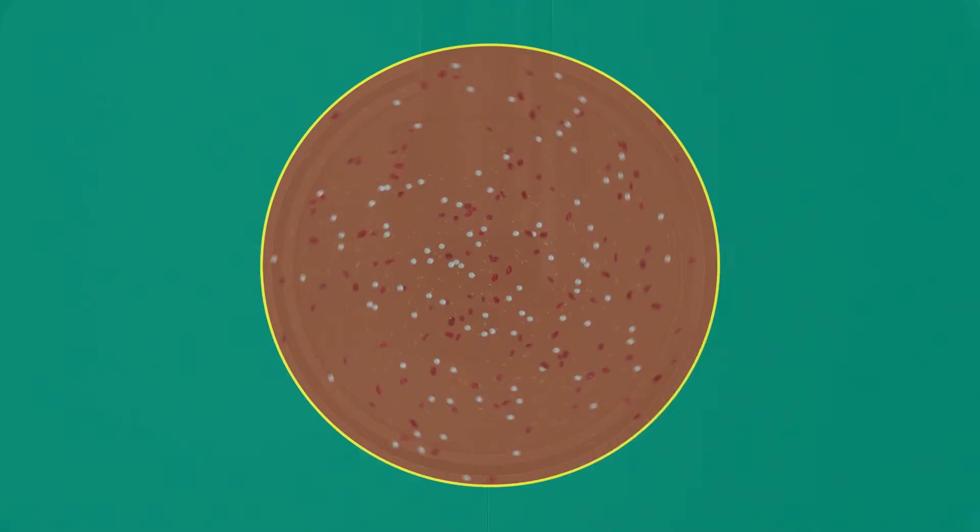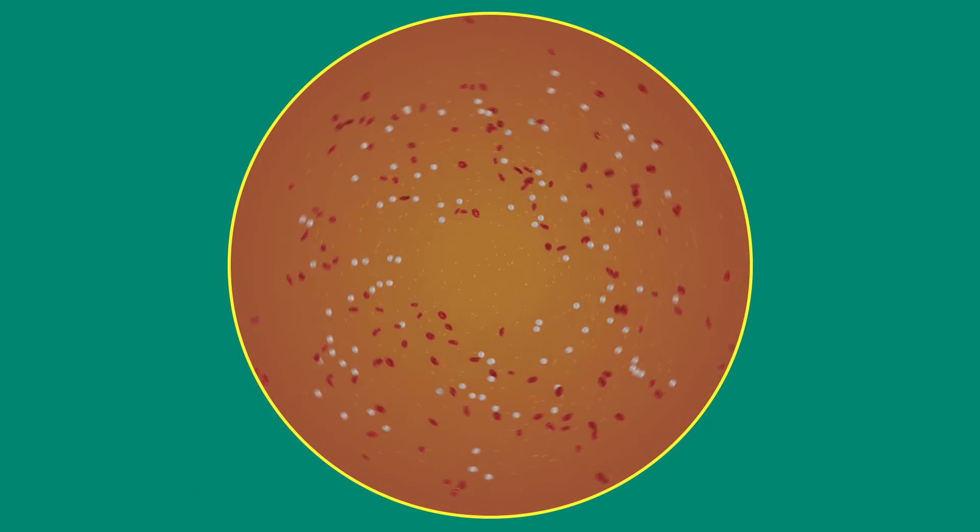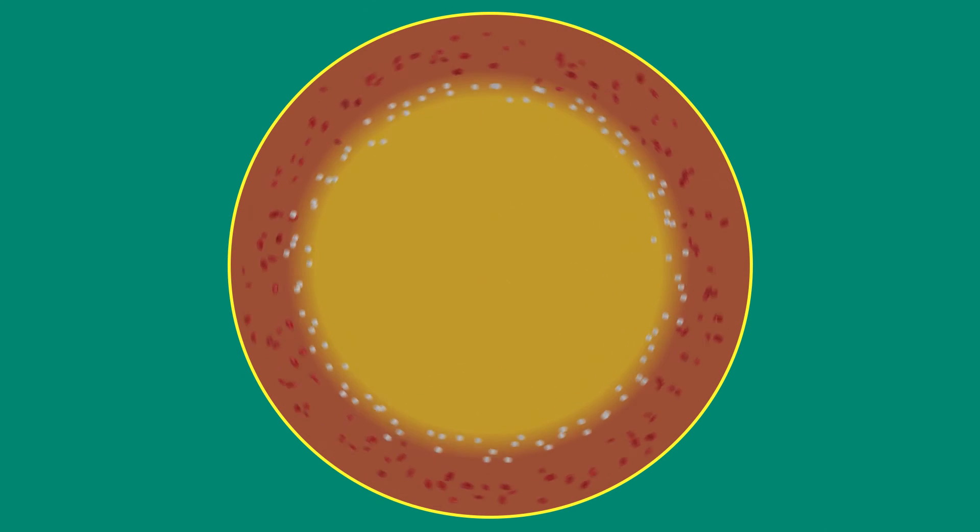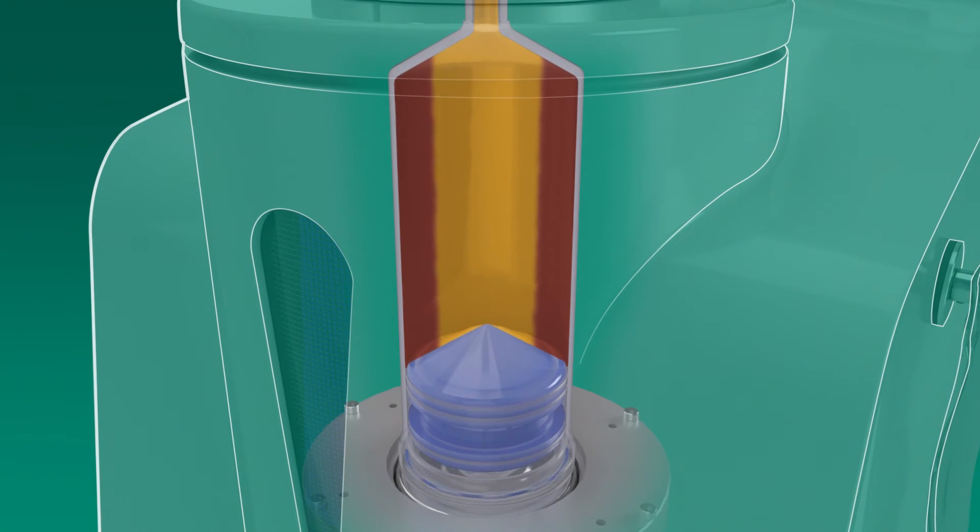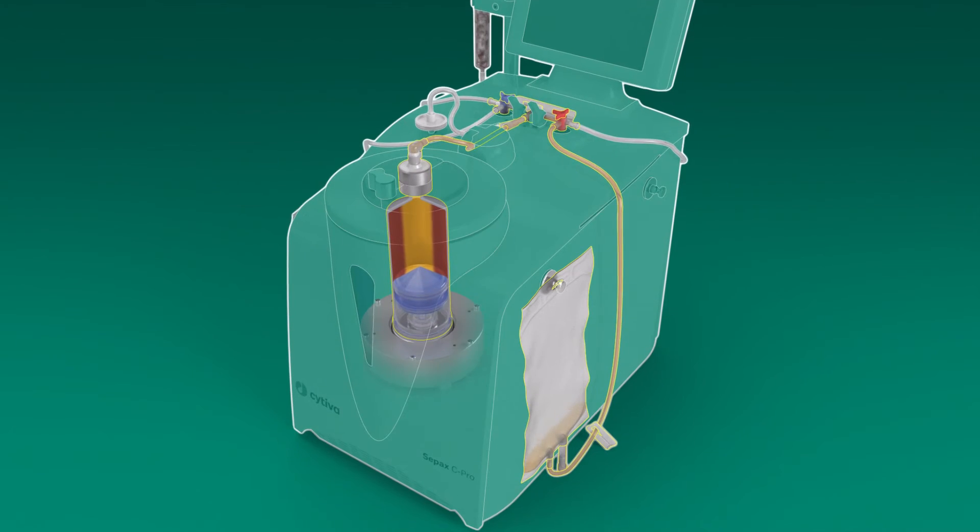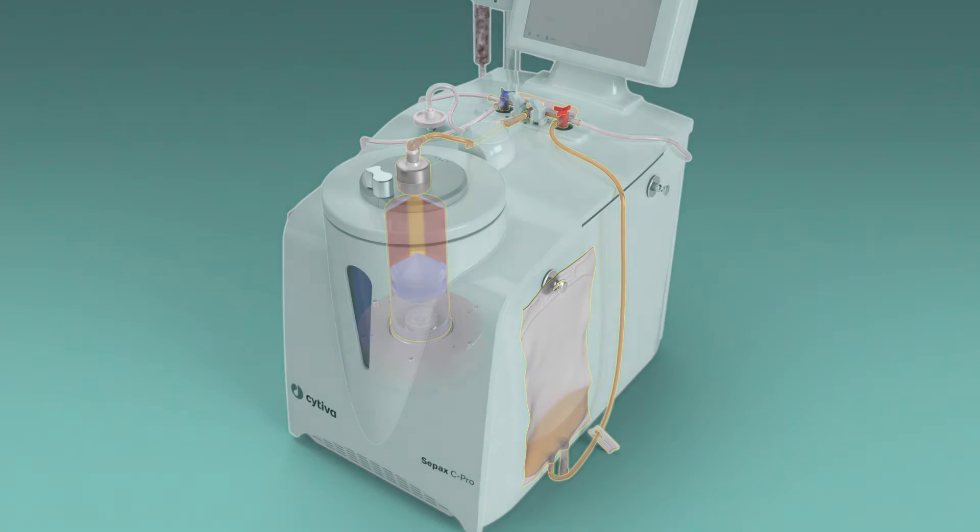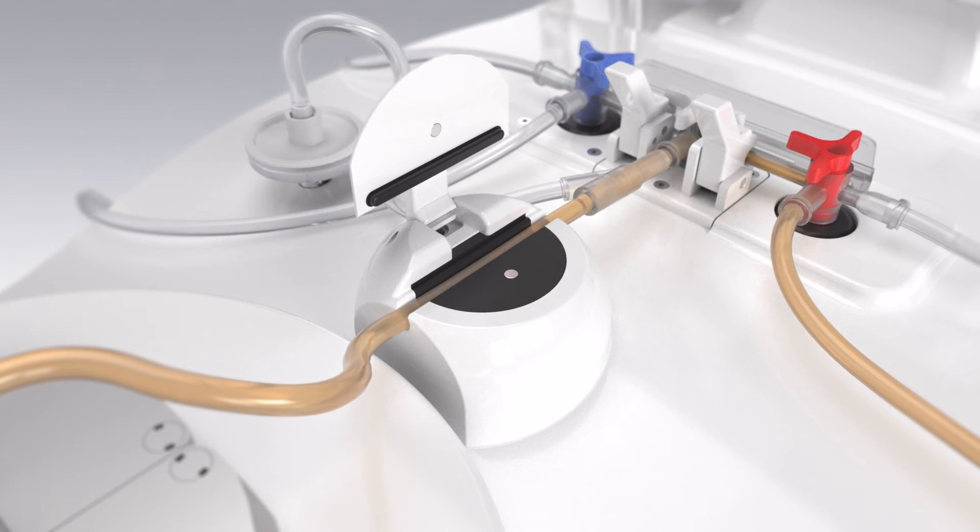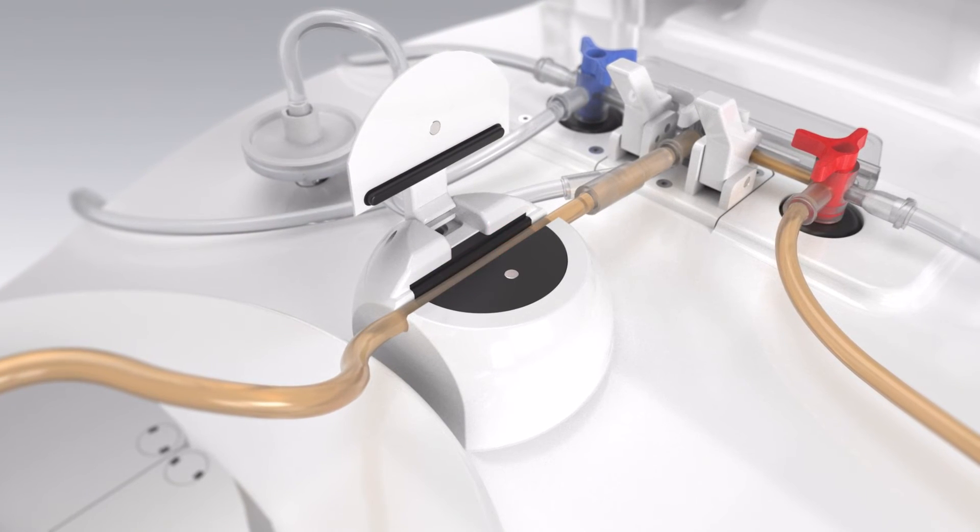During centrifugation, the product fraction with the highest density moves toward the wall of the separation chamber. The supernatant located along the spinning axis of the separation chamber is the first product extracted into the waste bag. The optical sensor detects what passes the optical line to monitor the process.